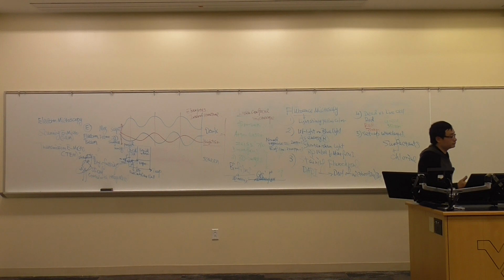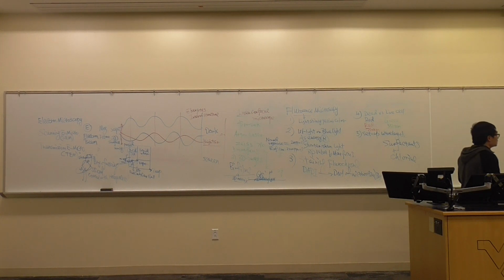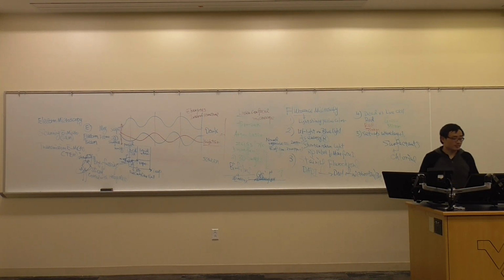So that's the atomic force microscope and its function. We could also measure the width, the height, and the roughness, and then do the comparison to see the statistical difference. We obviously find the width you cannot even measure.